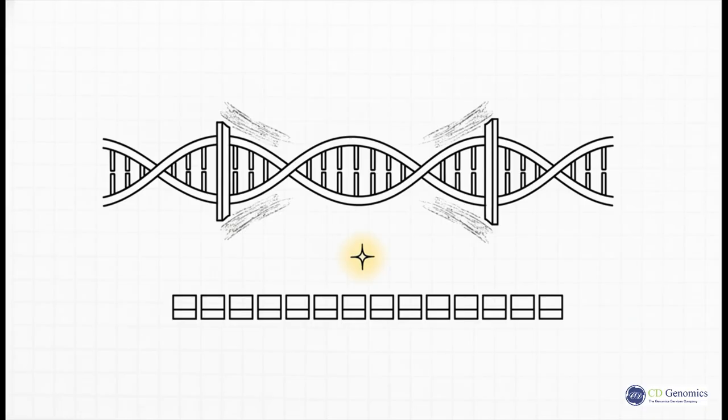This means you completely eliminate the need for physical interruption and those finicky size selection steps. Now, even though you might generate fewer fragments compared to single enzyme RAD approaches, the sheer consistency of these short tags gives you superior resolution, massive coverage, and totally uniform amplification efficiency during PCR.